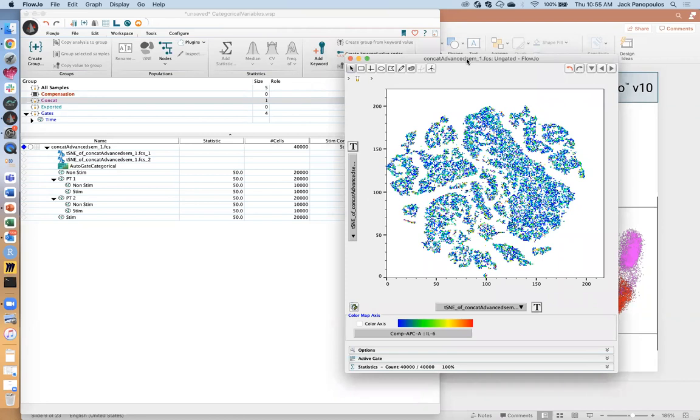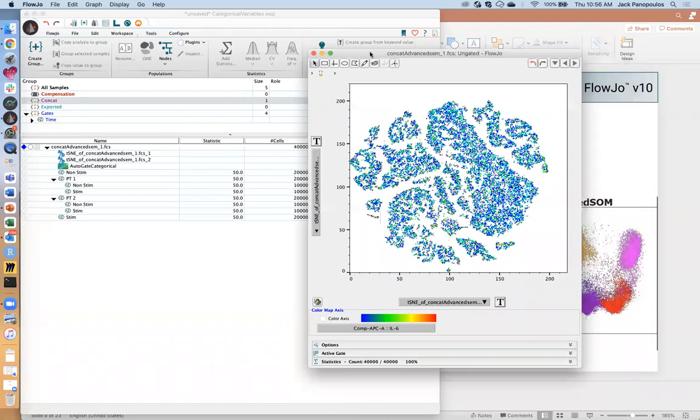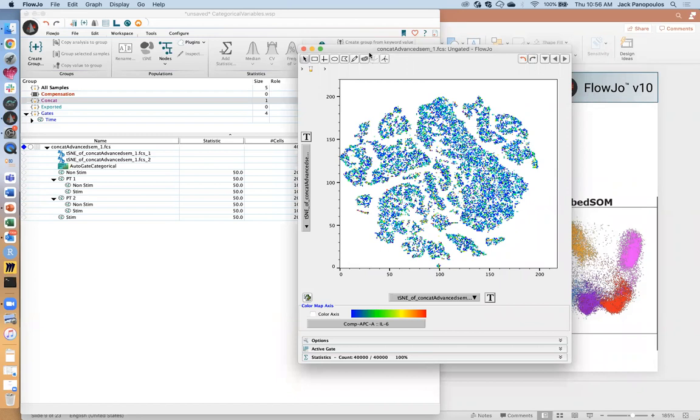I'd have to check again and see what we've actually been able to push this to. So with a cautionary statement here, I would say 50 million is probably your upper limit. But if you've got a nice beefed up computer, you might want to try more than that. But in general, 50 million seems to be the practical upper limit on most desktop computers that aren't fitted to be ultra high performance.